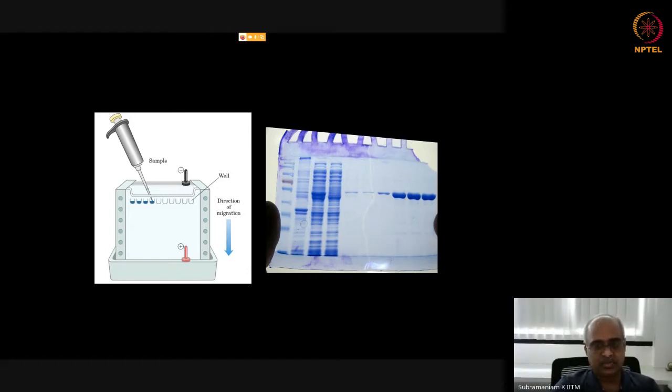First you fix the protein to the gel so that it doesn't diffuse while you are staining, because it's all in liquid. So protein can readily diffuse if it is soluble in the aqueous buffer. So the fixed separated proteins, when you stain with the dye, then the dye binds to all the proteins. So that process is called staining. Then you wash with a solution that removes the non-specifically bound dye, bound all over the gel, and only the dye molecules bound to the protein stay there. That helps you to visualize the proteins.